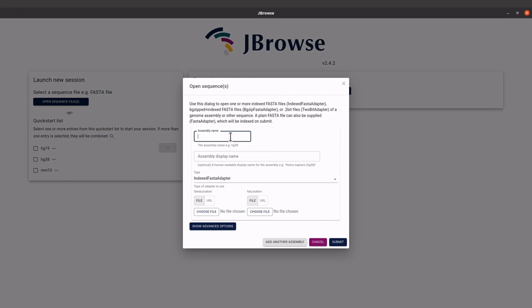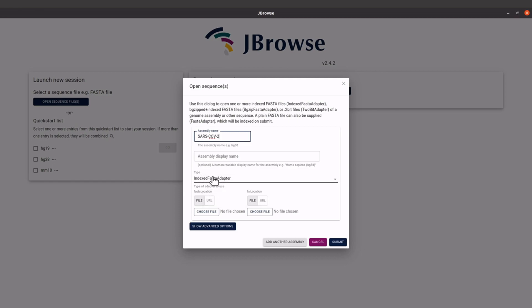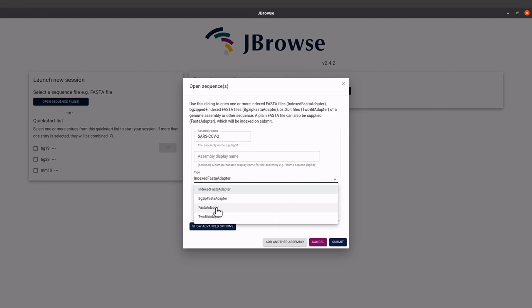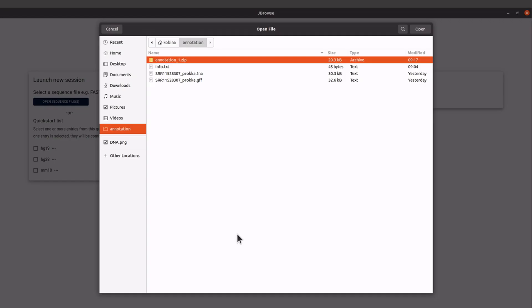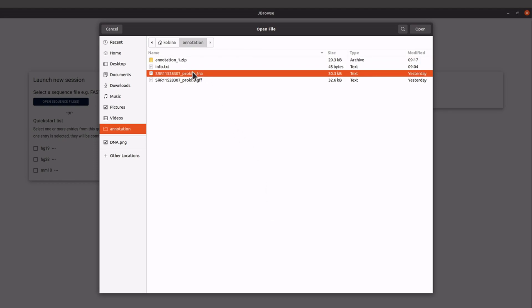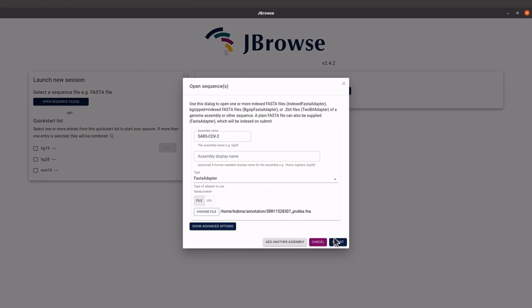You'll see a form where you need to enter an assembly name — I'll type SARS-CoV-2. The assembly display name is optional so I'll leave it. Under sequence type, select the FASTA adapter since we have an unindexed FASTA file. Click on File, then Choose File, locate your FASTA file, open it, and then click Submit.